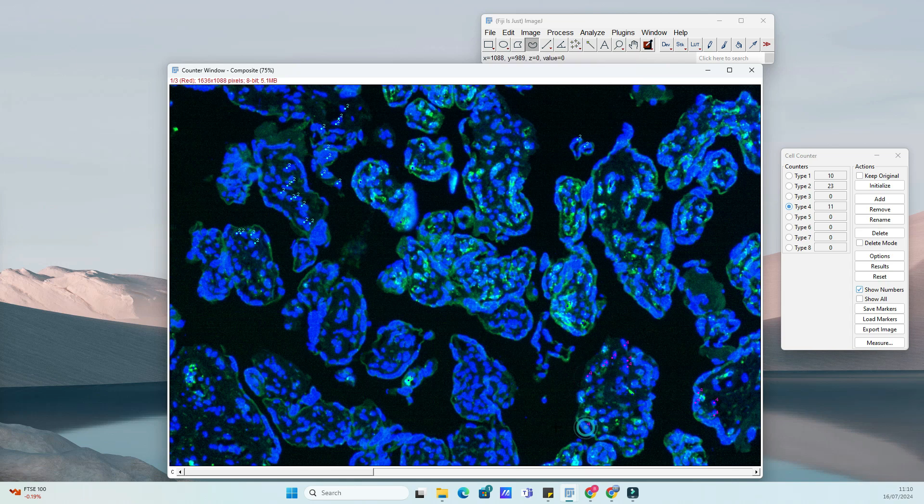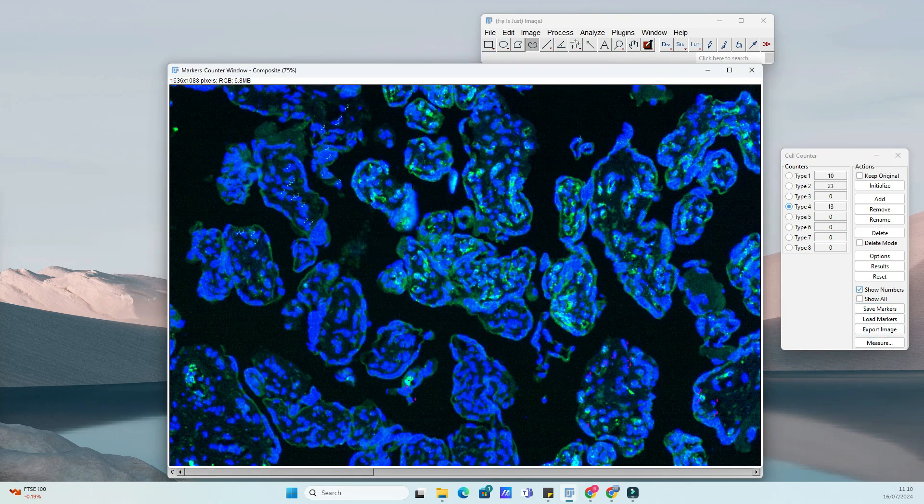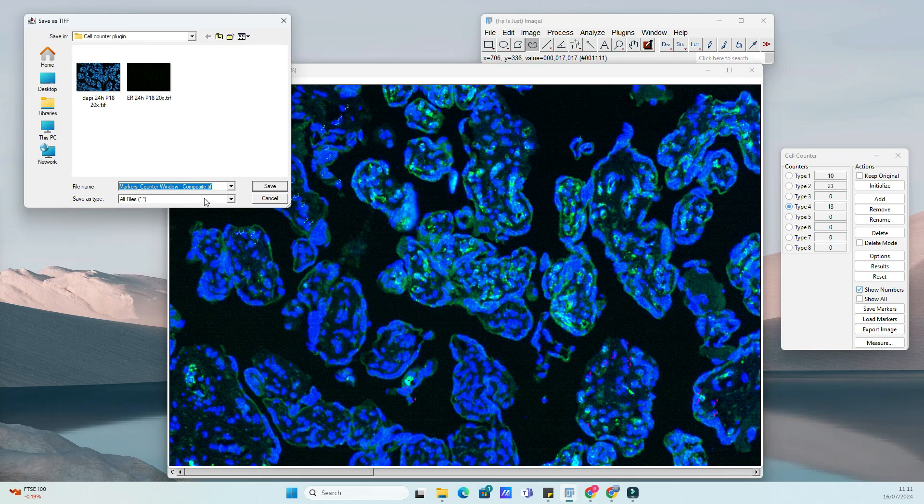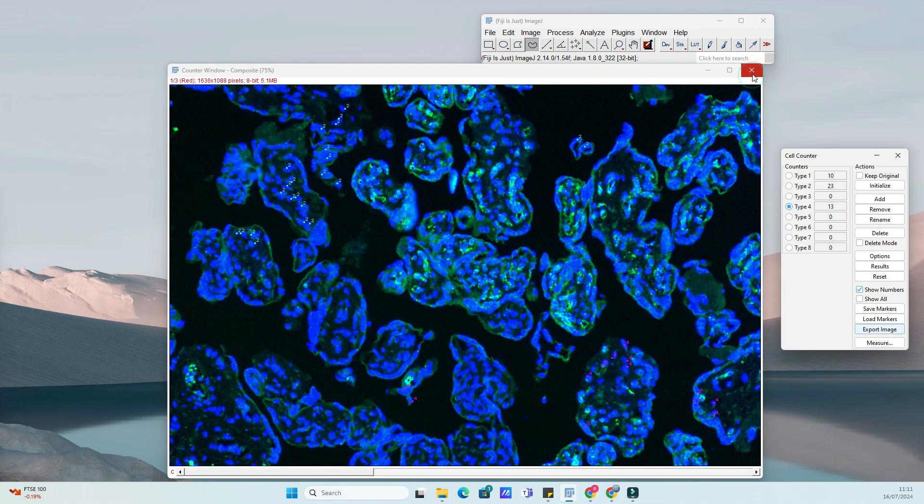Once you've completed your counts, you can export the results in various formats, such as text files or spreadsheets, for further analysis. You can even save the count, so you can later check with your peers if you performed it accurately or not.